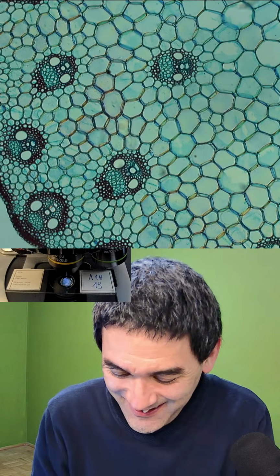The vascular bundles look a little bit like faces, almost like skulls. By the way, I can turn on the arrow, but I think it's not visible on the vertical live. So those things are the vascular bundles, and those large cells in the middle, that's the xylem again, the tissue that transports water up the plant.